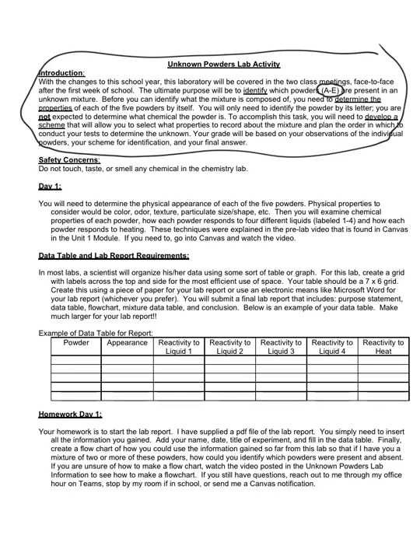So at the very end of the lab, your conclusion will be, I had unknown mixture number 12, and I determined that powders A, C, and D were present in the unknown mixture. You do not have to tell me what the powders are. That's sometimes something I think students fail to do or think about. All you have to do is tell me which ones are present.